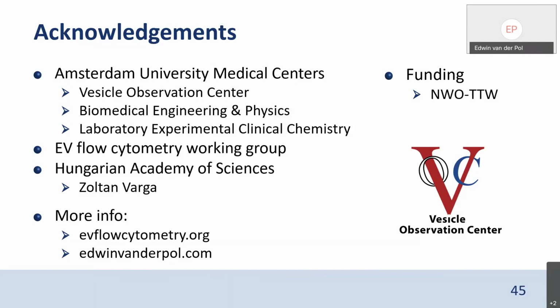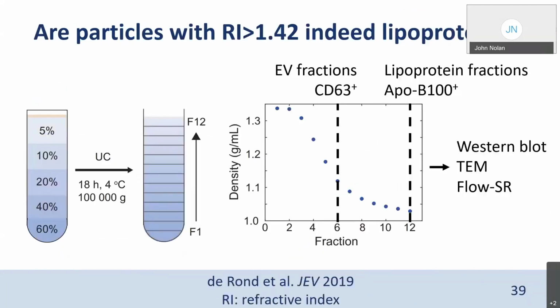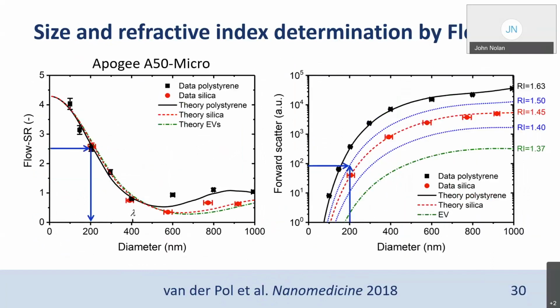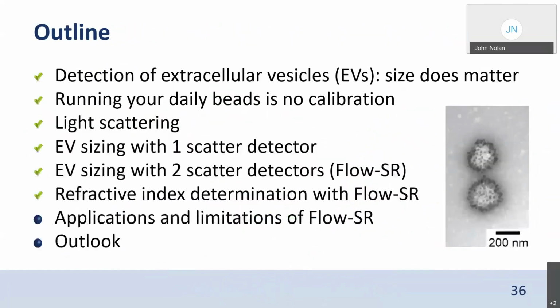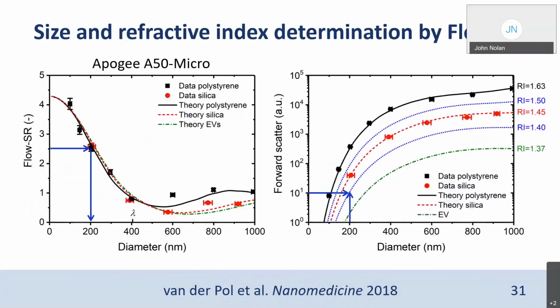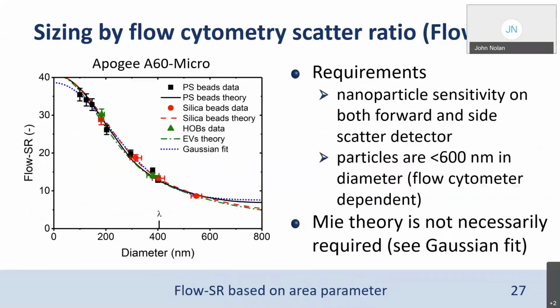Okay, a couple of practical questions here. One is from me. Say I have a flow cytometer, whatever brand, and I want to assess my ability to do this. What test should I do, and what will it tell me? If I run some beads into this analysis, will it tell me the size limit of detection of my instrument? And then a related question, someone asks, how would this work in the ImageStream imaging flow cytometer, which has no forward scatter?